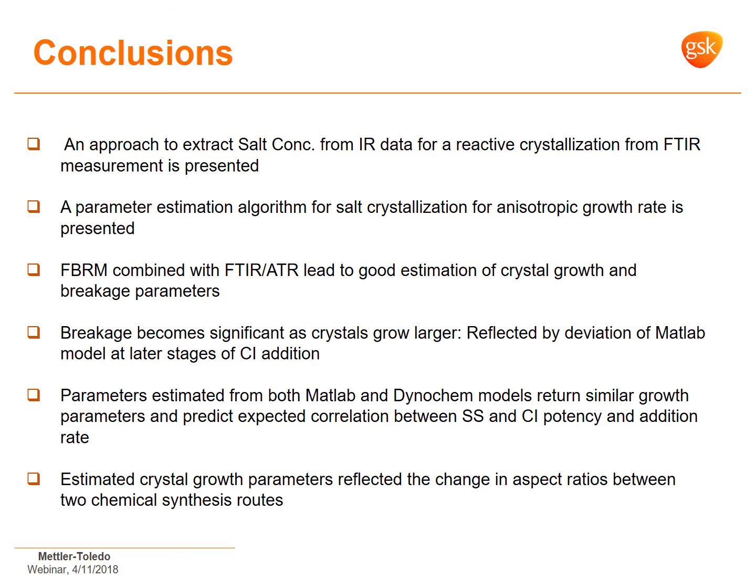Both models return similar values for growth rate, and we give a possible explanation as to why the FBRM is returning the same value as the fast-growing phase. And finally, the estimated crystal growth parameters reflect the change in aspect ratio between the two chemical synthesis routes.